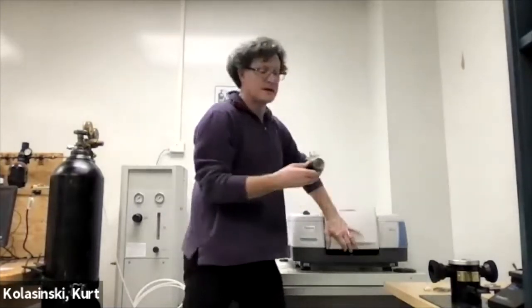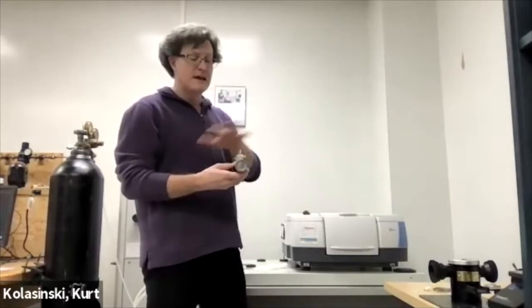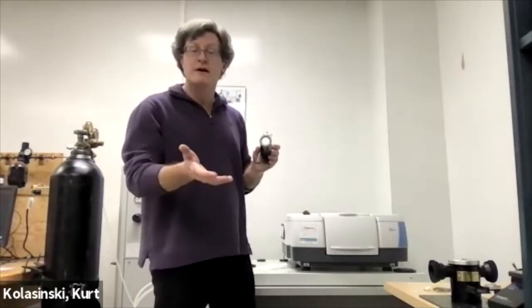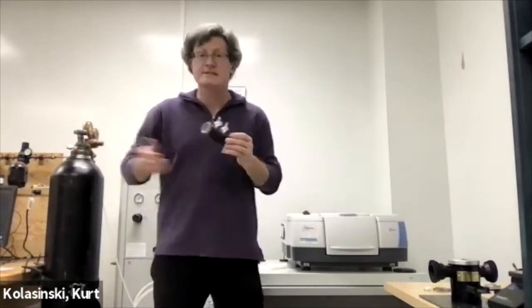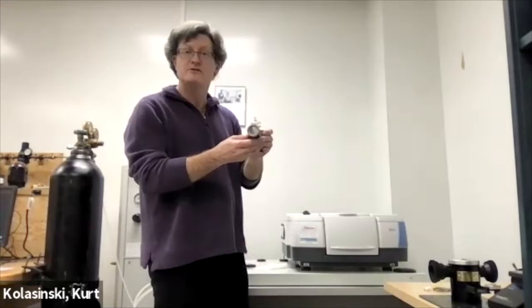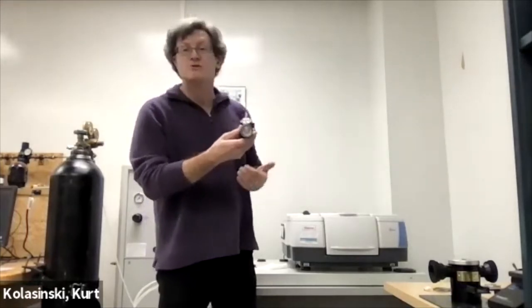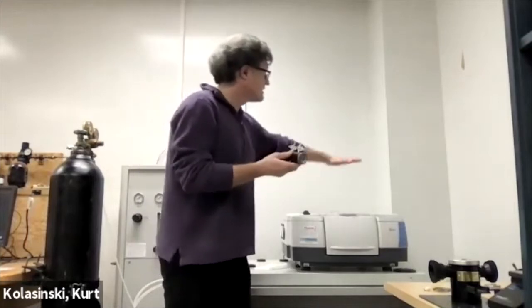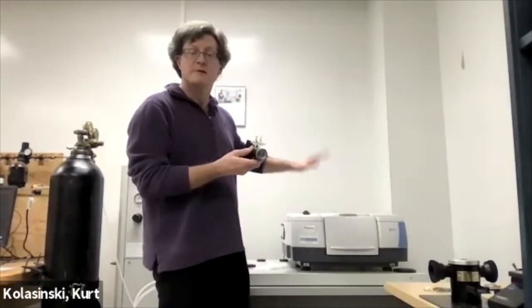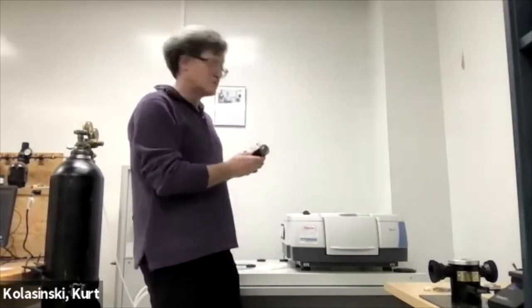Okay, because if you have the cell empty and everything else empty of things that will absorb IR, you can put a purge gas in there, argon or nitrogen, right? And so if we fill that first with argon, then we get rid of any absorption from the windows, and any absorption or transmission problems in the spectrometer, we can average out all of those, get rid of them, and then we're going to put our cell in.